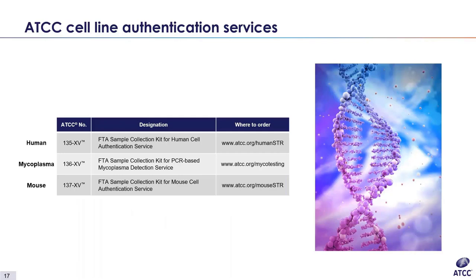So I've just talked about STR profiling, mostly in the context of human cell lines, but this also extends to mouse STR profiling. I'm about to turn the presentation over to Balsam, who will present ATCC's new mouse STR service.